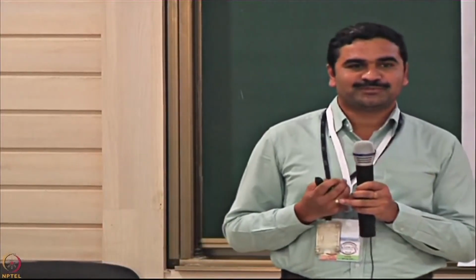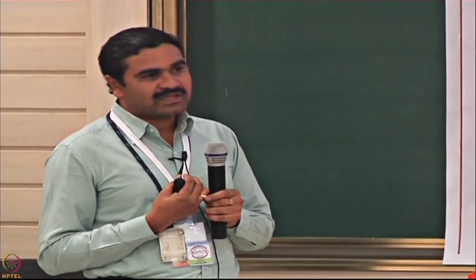In my lecture, I don't have any hands-on training session to give you to perform the experiments, but all the necessary steps you do are the same in this, except that the sample to antibody is reversed. That's why it is called reverse phase protein arrays. So I will try to stress where it is different from the routine protein arrays, what steps are to be taken care of to perform the arrays, and how to do data analysis.